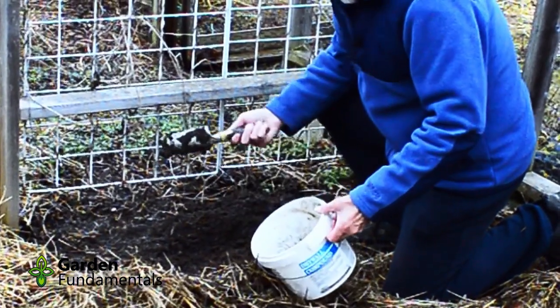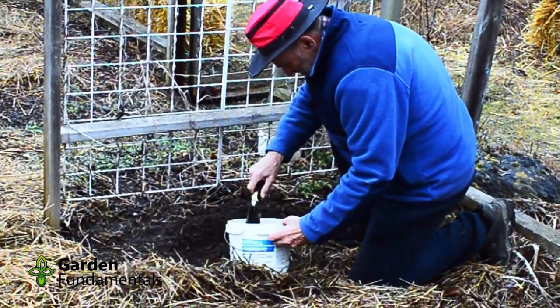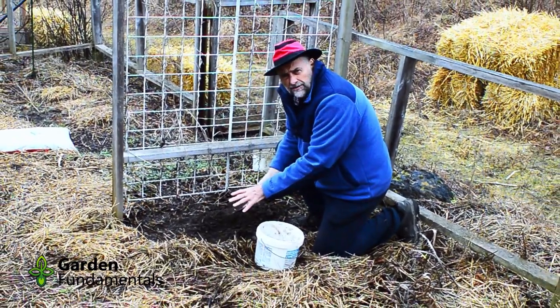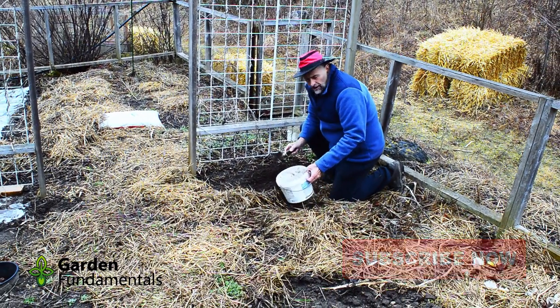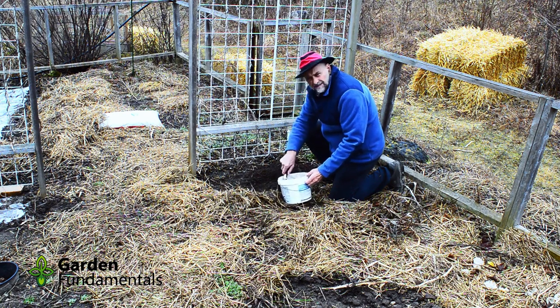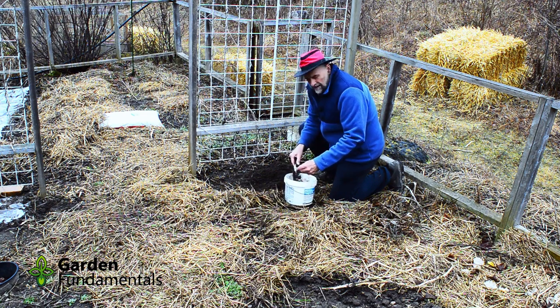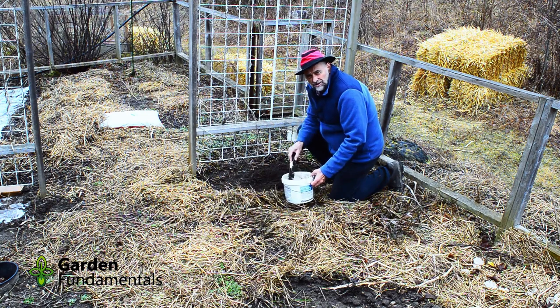Get yourself a container and just get a shovel full of soil. Now you can just measure one spot if you like, but it's a good idea to take a couple different spots and then mix them together. So I'll get another three shovelfuls of soil, put them in the pail, then mix it up really well. Take out any stones or pieces of plant material. Once it's all mixed well, we can use this to prepare our soil sample.